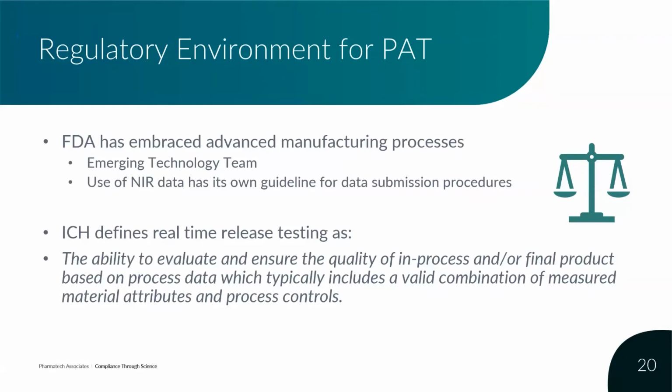And then finally, a product's partial or total release is possible using process analytical technology data. Real-time release testing is not required when you use process analytical technology.